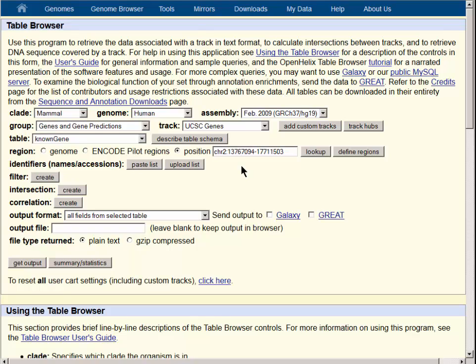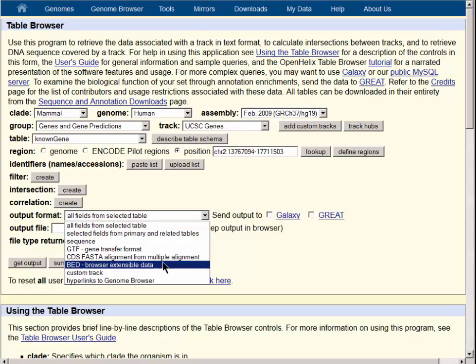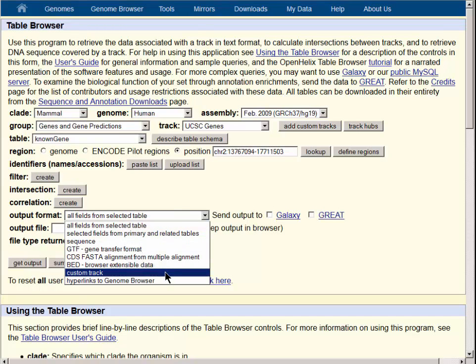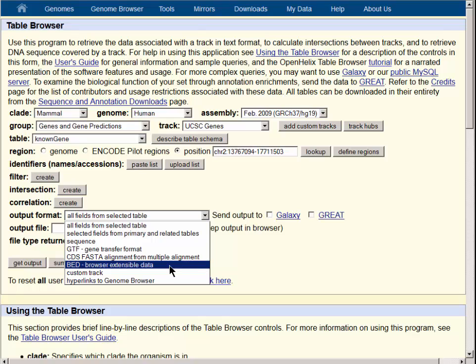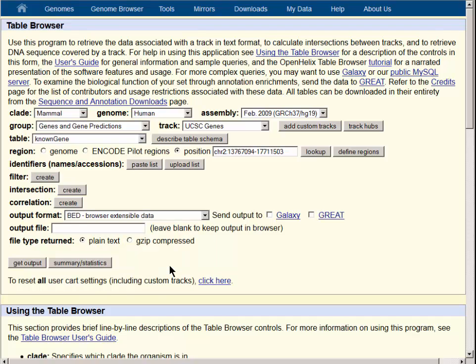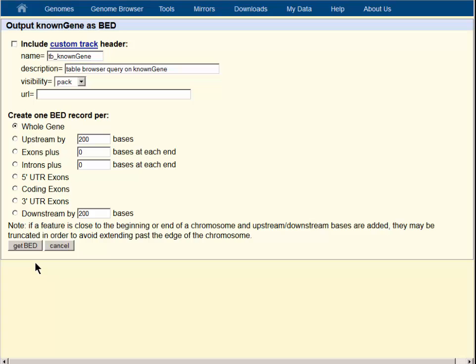To get the custom track for the upstream regions, we can go directly to a custom track if we like, but for this demonstration, we will instead go to the browser extensible data as an intermediate step. We'll be able to see our data on the screen before we go to the custom track. So the bed file output is selected.